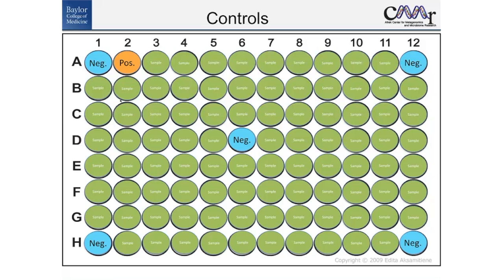Okay. Now let's go to the bioinformatics. You were talking about the OTUs, and I was wondering which software do you use to actually get into your OTUs, and is your pipeline automated? It is. So we have a team of bioinformaticians that developed something called Sage, which is available to people to use as freeware. I don't have the link, but if you just Google Sage and Baylor College of Medicine, it should come up, either that or email me, and I can get that to you. I will tell you, I'm not a bioinformatician, so if we want heavy into analysis, I'll pull one of those guys in.